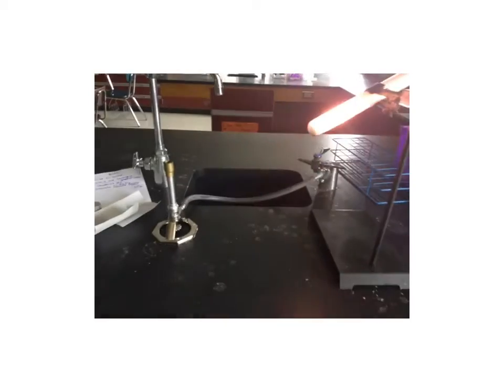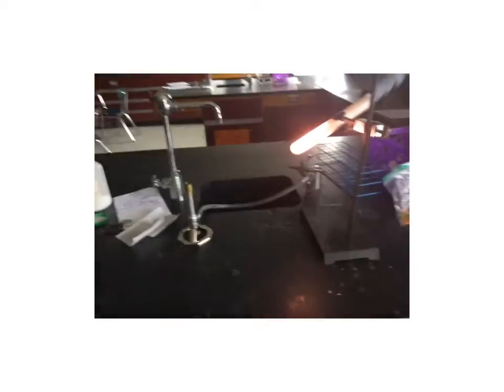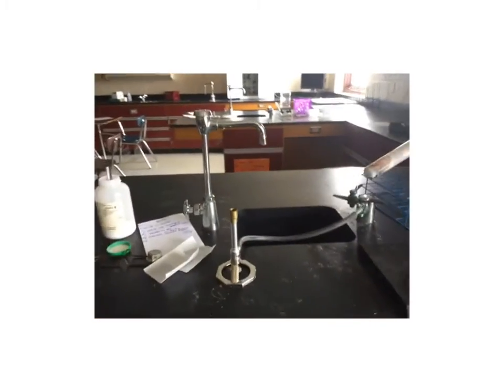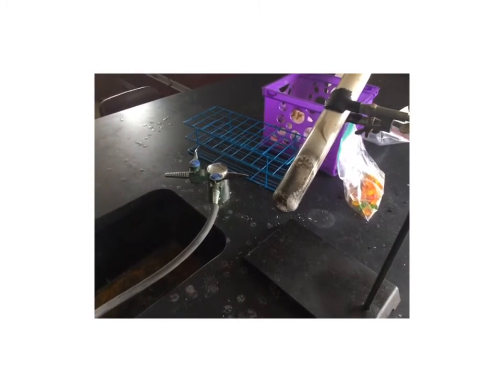Of course, for the video. All right. It is hard to get the color, but it is a pinkish flame. Pinkish flame. And now it's done. You can kind of see it's still going a little bit in there. Ultimately, it turned into a black solid. Okay, so now you've hopefully written down the color that it is. So it was a pinkish flame, and so if you notice, it stayed the same.